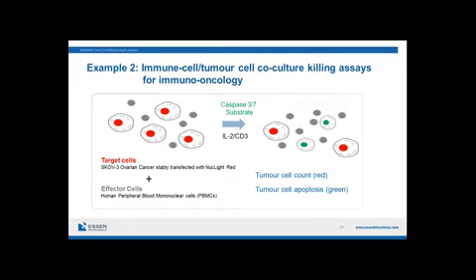We first labeled the nuclei of the ovarian cancer cells with a nuclear-targeted red fluorescent protein so that we could quantify the cancer cells in their own right. We duplexed this with a measurement of apoptosis using a fluorescent caspase 3/7 substrate, which only fluoresces when cells begin to express an active caspase enzyme.